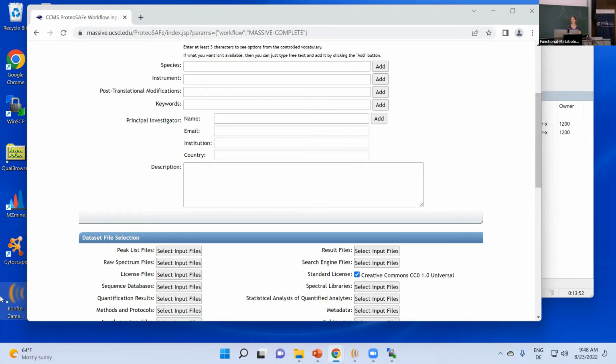And then when you publish your data, you can modify that to make it more expansive at that point. I've talked to people who didn't want to make their data public because they were nervous about that. But then I told them, you don't have to have every single detail there yet. Just at the end, once it's published, then you can add more details so that your data can actually be useful.